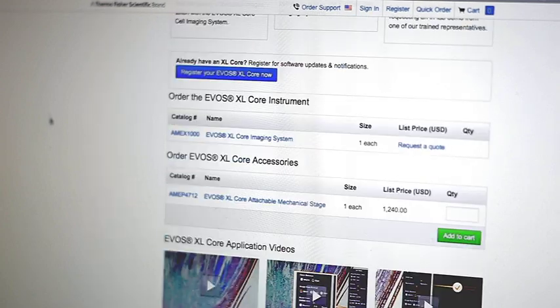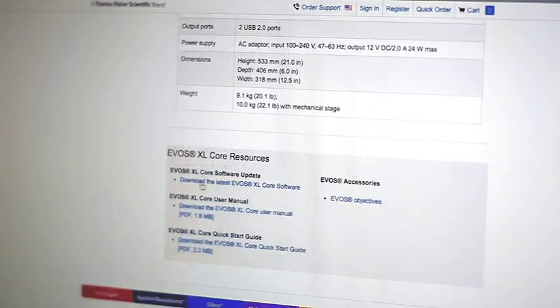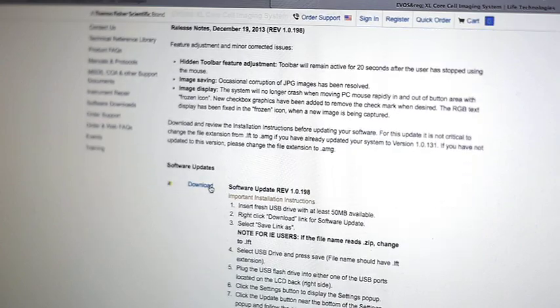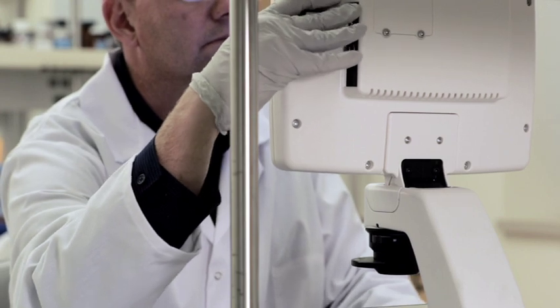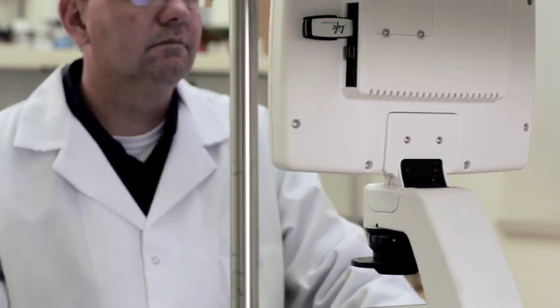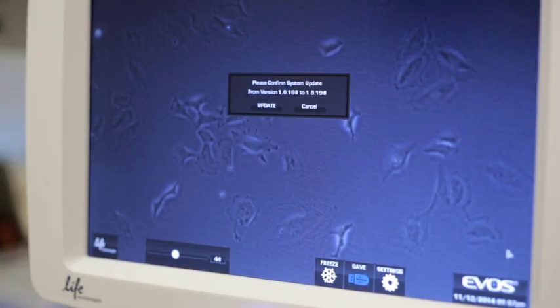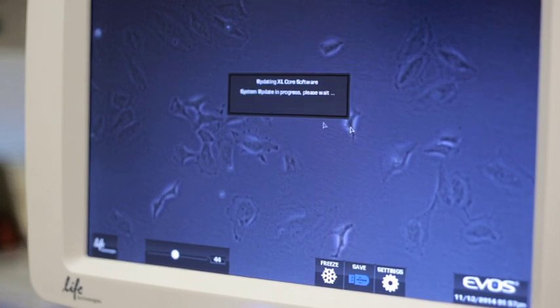If a software update is ever required, we provide free downloads of the software upgrade on the support section of our website. Simply download the required software to a flash drive and insert into one of the two USB ports on the instrument and select the software update button located in the settings menu.